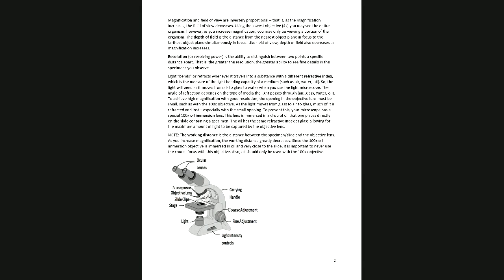So whenever you get your microscope, the first thing you do is clean it, starting with the ocular lenses, then the scanning lens, and work your way up to the oil lens. But you really need to make sure that the high dry lens is clean, because even the slightest smudge of oil will make it almost impossible to see through it on high dry.